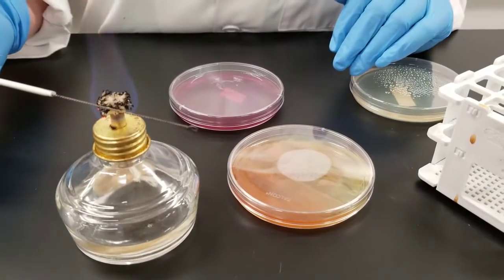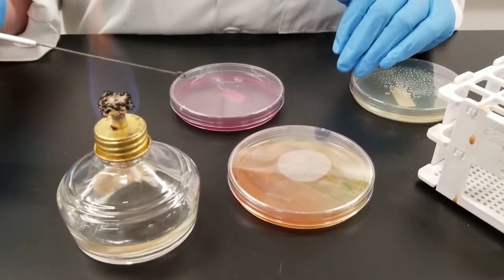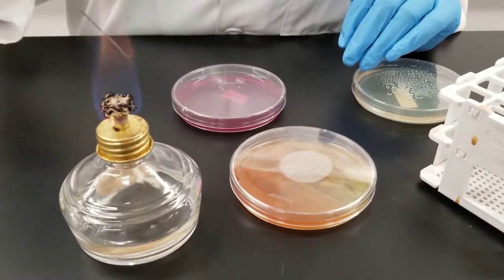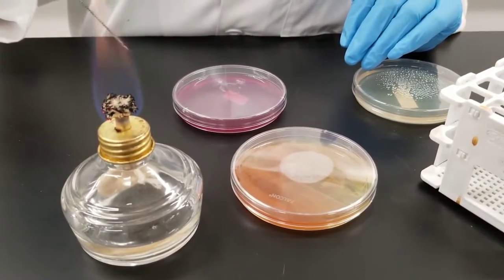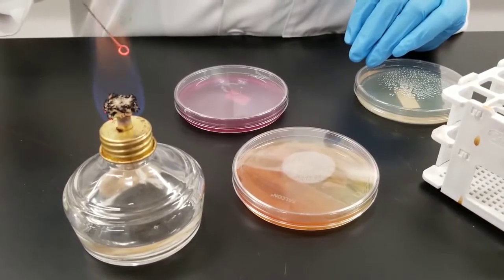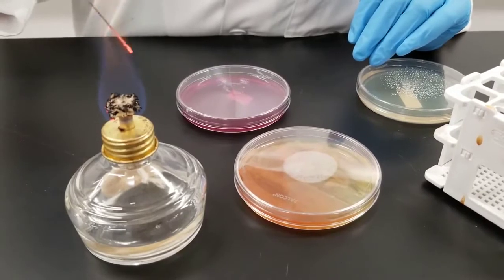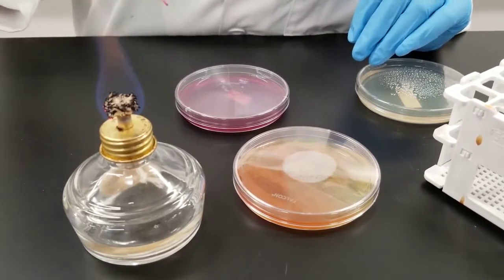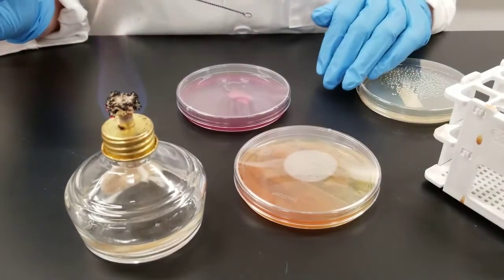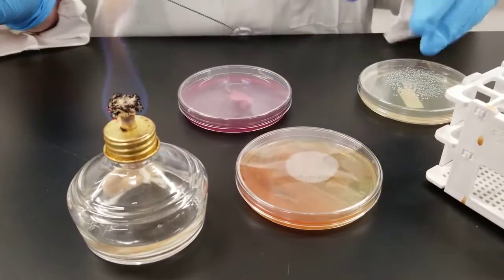I'm going to show you how to inoculate from a plate to a plate. First thing we always do is sterilize the loop. Get it so it's nice and glowing red. Hold it in the flame for a bit, then let it cool. You do not want to go directly into the sample because you will basically hear a sizzling, which means you've just killed everything. So let it cool a bit.